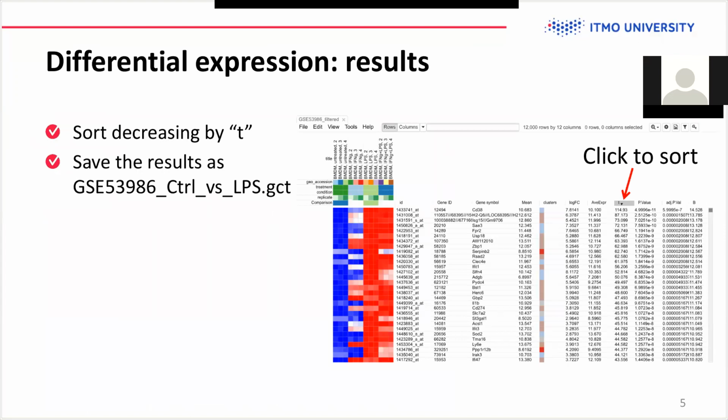Yeah, I just have a question about, I guess, the 10th or 15th gene, because it does not have that colorful red color for LPS, and still it has a great difference in the numbers. How come we have a big difference in numbers, but still not that much difference in colors in the heat map? Which gene again?